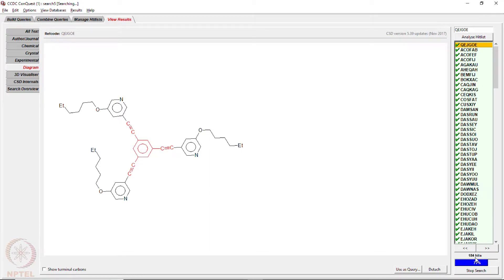This gives you an idea of which areas have a large number of reported structures, what all are reported in that area, and based on that you can find out what has not been done in the database. This is one way to confirm the existence of a particular type of molecule that you are trying to make, which is very important for starting a new research wing in crystallography and materials science.